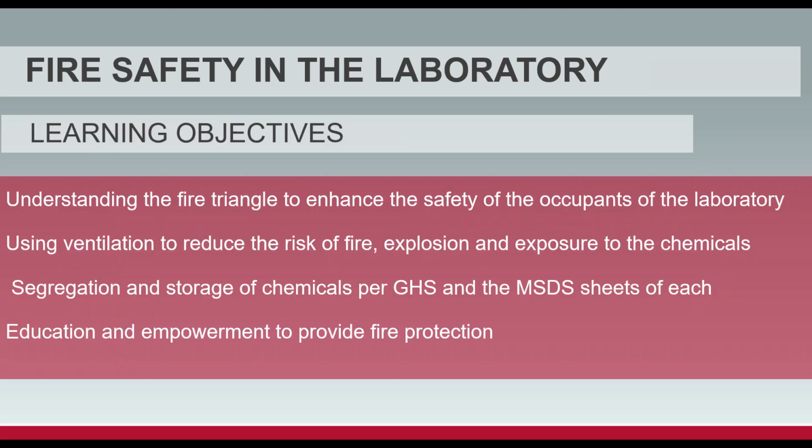Ultimately, there are four learning objectives. It's all about the fire triangle, and how we enhance safety for the occupants in the laboratory space without decreasing their efficiency or their process. In America, we talk a lot about the KISS principle, keep it simple, stupid. I don't mean that as a negative statement at all, but it's about how we keep it easy for these researchers to do their work.